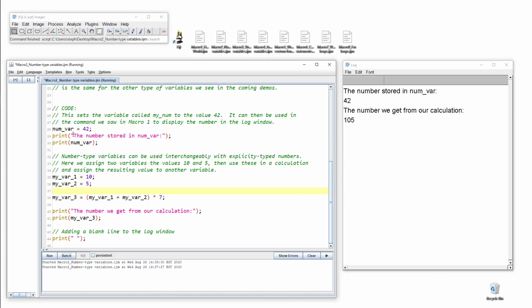So the thing that we'll really see in the next slide is that explicit string or explicit text that we want it to display uses these quotation marks here, whereas when we don't use it, you'll see that it's coloured black and it applies to a variable. So as with comments, which come in green, functions, which are this delightful sort of browny, yellowy colour, we've got text here in pink, we've got numbers in purple, variables in black, and there's also little bits of red for kind of like structural elements, and then you'll also see a few keywords later on highlighted in blue.